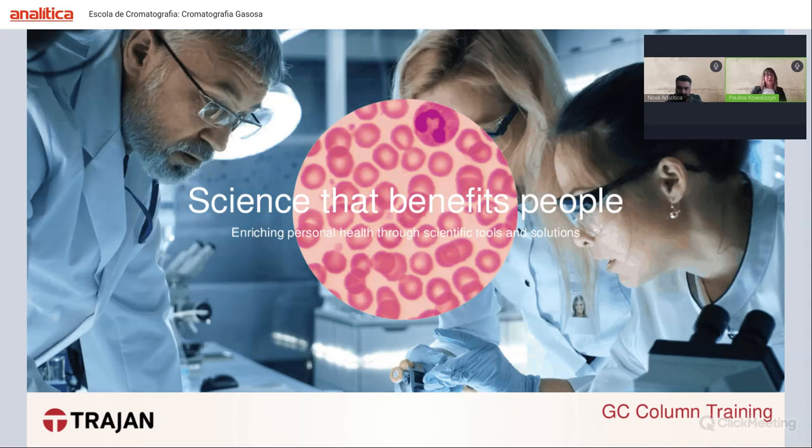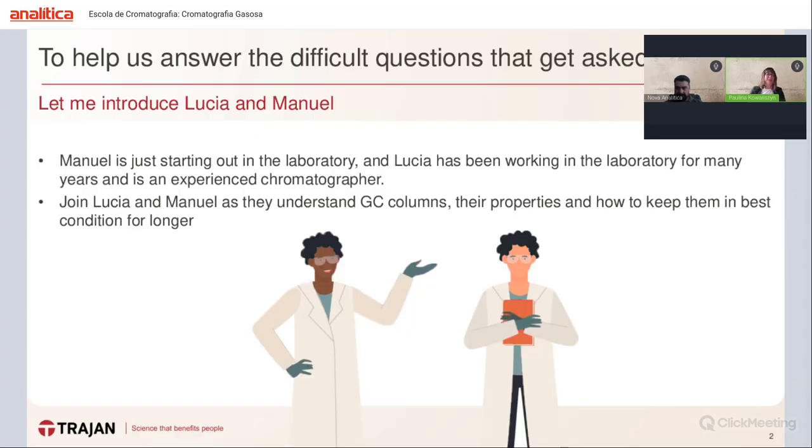And as you're familiar with our friends, Lucia and Manuel, we will be learning along with them about the GC columns, about their properties, how they work, what different properties and how they affect our results, and how to keep our columns in the best condition for longer.